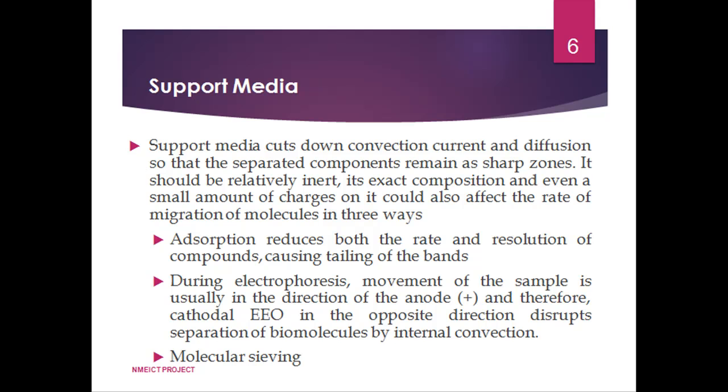Electrophoresis is done from the negative to the positive terminal. Another property is molecular sieving. This property is exhibited when gels such as agar, agarose, starch, or polyacrylamide are used as a supporting medium. Intertwined molecular chains in such gels result in a sieve-like structure. The pore size can be increased or decreased by decreasing or increasing the gel concentration. The movement of a large molecule is increasingly retarded by decreasing the pore size.